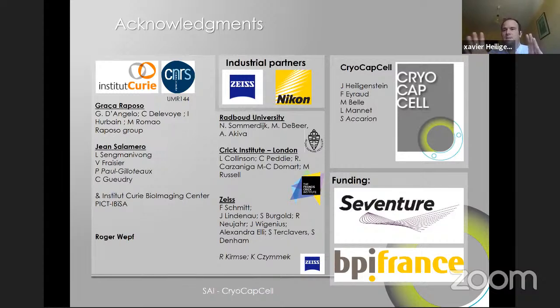But indeed, this is becoming something which is multiplexed, and reasonably, no one is able to handle all of this at once anymore. Technologically, doing correlative microscopy is a specialty nowadays, and you have specialists in CLEM, who are mostly coming from EM or LM, and they just did the bridging, but this is becoming something critical. But then someone like me who's doing some technology development cannot be a talented informatician or mathematician and be a talented biologist. I mean, some people are brilliant enough, but I'm definitely not brilliant enough.